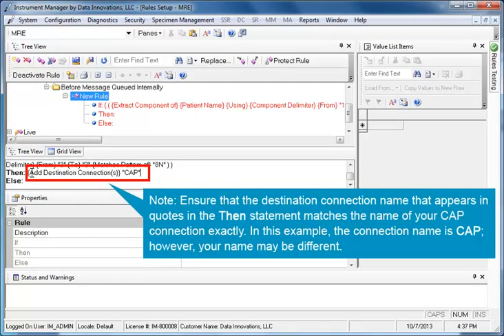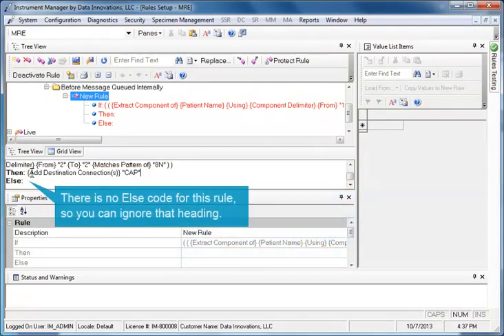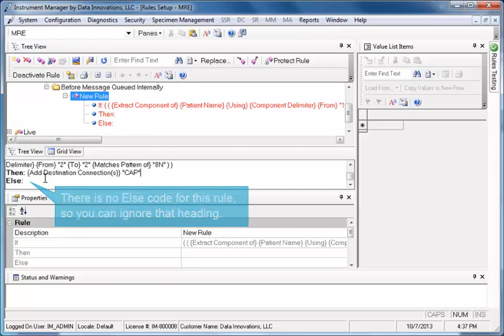Note, ensure that the destination connection name that appears in quotes in the Then statement matches the name of your CAP connection exactly. In this example, the connection name is CAP, however, your name may be different. There is no else code for this rule, so you can ignore that heading.